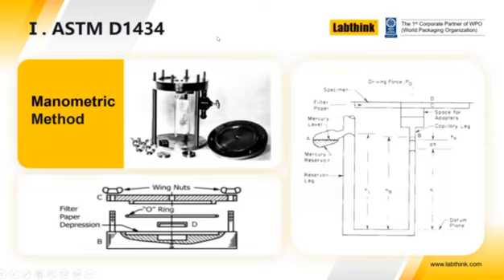To look at the manometric method, there are several diagrams on the screen here. The photograph that you see there is taken directly from the ASTM standard, and it is the original apparatus designed for this method. For those of you who are old enough, around my generation, and perhaps George, you might think back to your school days and look at this picture and think it resembles something that you may have done in physics or chemistry class. It's a very rudimentary assembly.